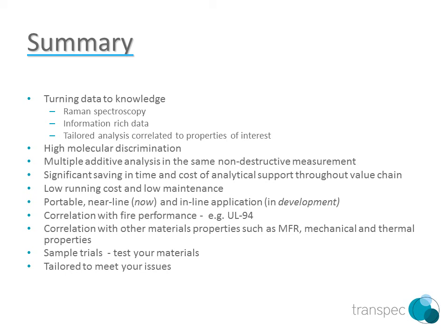The speed at which this analysis can be taken offers significant time and cost savings. To see how TranSpec can work with your materials, we are offering sample trials where you can send materials to be tested to give you the confidence in these methods. We are constantly developing TranSpec to meet the needs of the plastics industry, so if you have a specific problem, we are here to work closely with you.